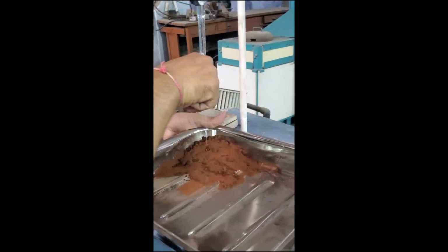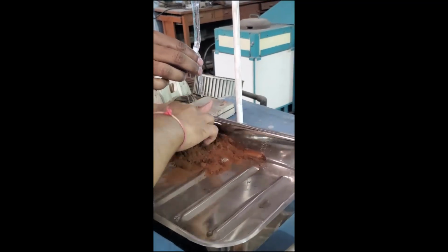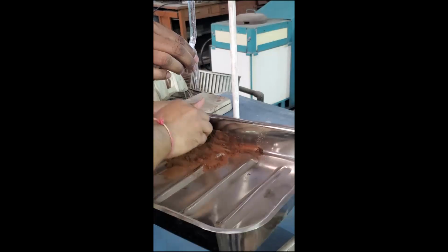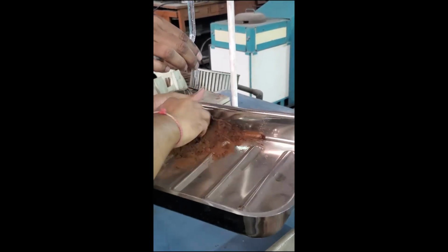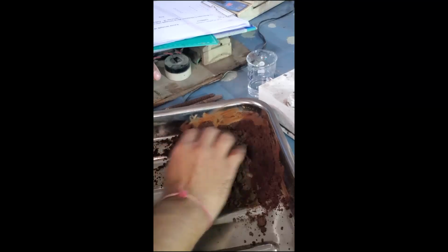Now we are adding 24 cc water from the burette. So now it is mixing properly, you can see.